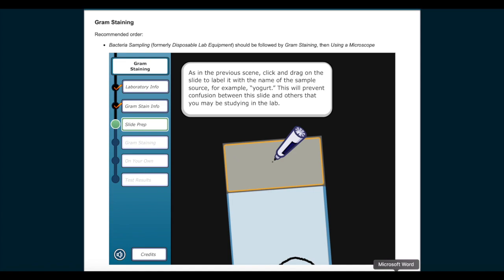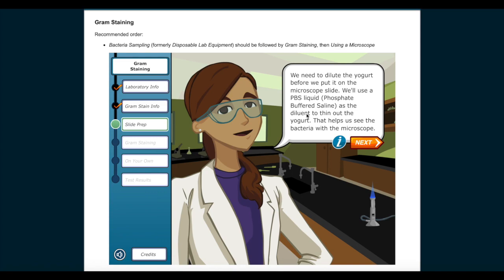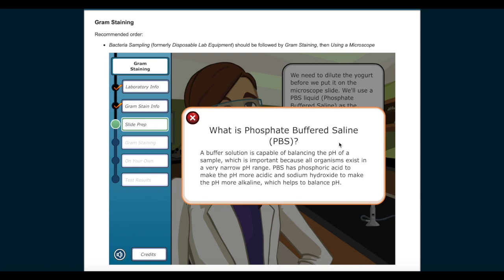As in the previous scene, click and drag on the slide to label it with the name of the sample source, for example, yogurt. This will prevent confusion between this slide and others that you may be studying in the lab. We need to dilute the yogurt before we put it on the microscope slide. We'll use a PBS liquid, phosphate-buffered saline, as the diluent to thin out the yogurt. That helps us see the bacteria with the microscope. What is phosphate-buffered saline, PBS? A buffer solution is capable of balancing the pH of a sample, which is important because all organisms exist in a very narrow pH range. PBS has phosphoric acid to make the pH more acidic and sodium hydroxide to make the pH more alkaline, which helps to balance pH.